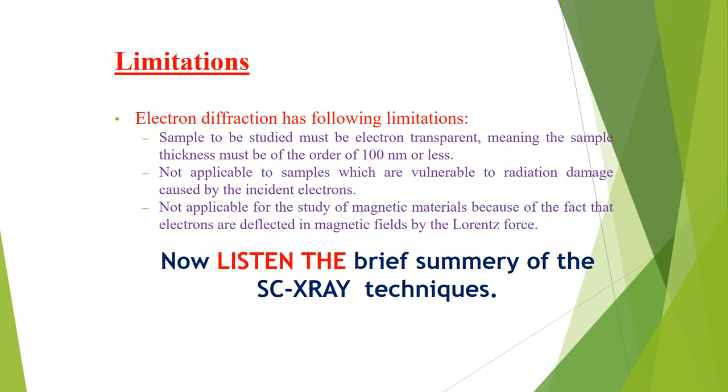A single crystal X-ray diffraction pattern can be divided into the geometry of the pattern and the intensities of the diffracted beams. The geometry of the pattern includes the lattice parameters and the crystal orientation, and it reflects the translational periodicity of the lattice structure.